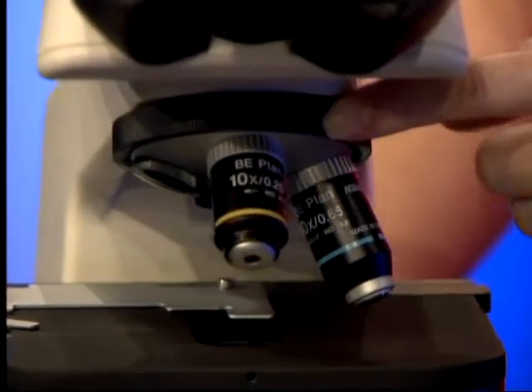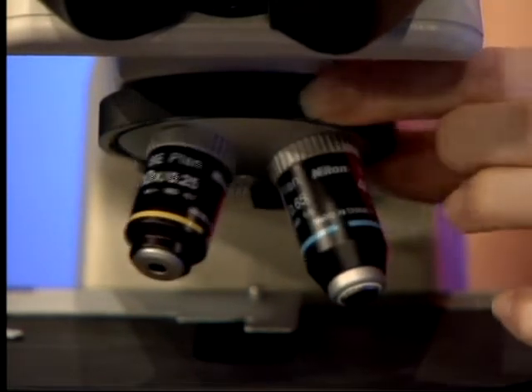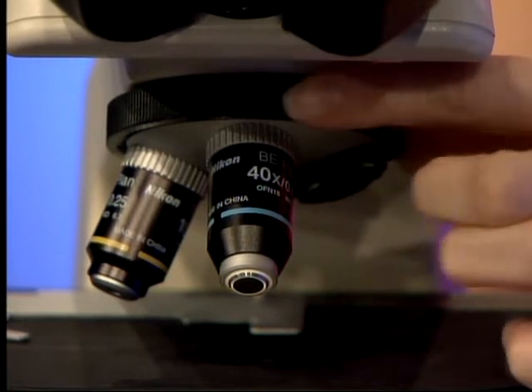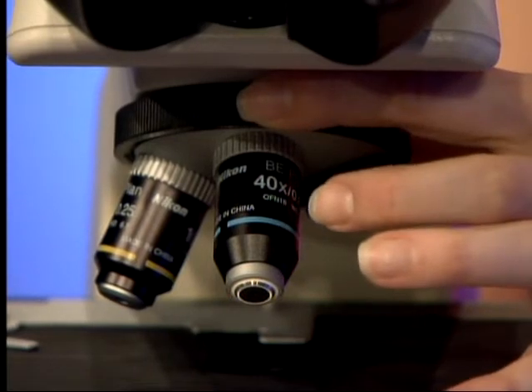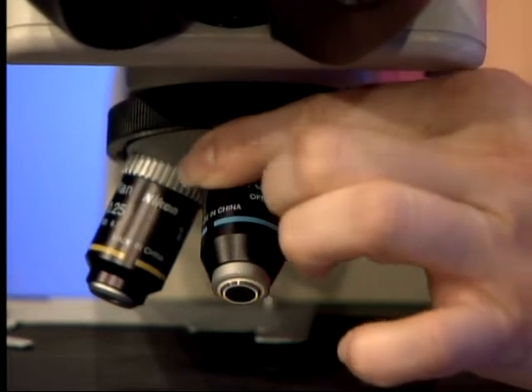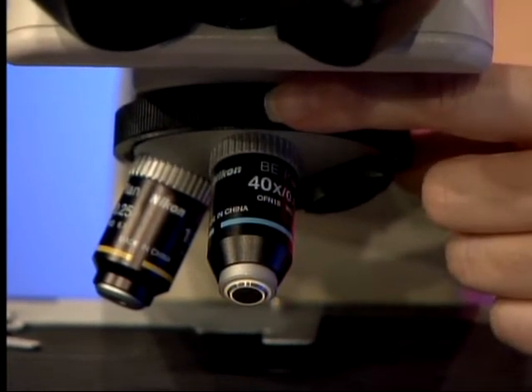Here we have the objective nosepiece and the two objectives attached to this microscope: the 10x objective and the 40x objective. The 40x objective has a blue ring and the 10x objective has a yellow ring. Whenever you are swapping between objectives you always want to use the revolving ring — you never want to grab the objective itself. If you do this consistently over time, the objective will get loose and there is a chance of it falling off and getting damaged.